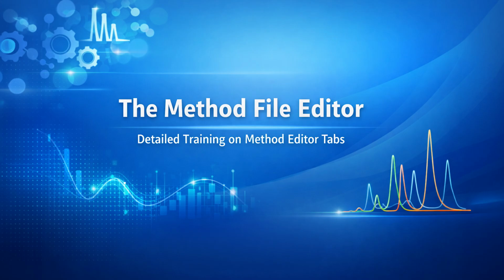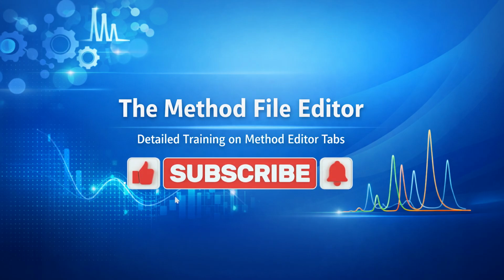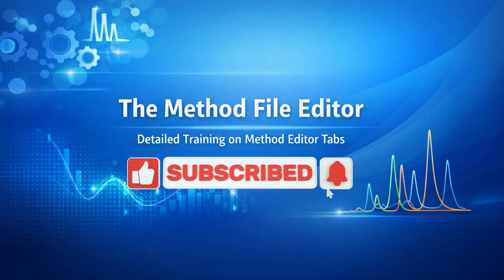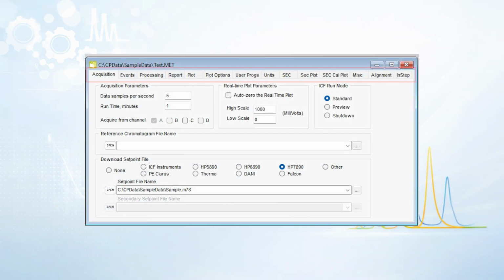In this video, we're continuing our detailed walkthrough of the Chromperfect manual, focusing on the Method File Editor, specifically the different tab sections within the editor and what each one does. This is a user training video, not a high-level overview. We'll be working directly from the manual and going through each tab and setting exactly as it's implemented in the software. Most of this video uses static screen captures from the Chromperfect interface, so you can follow along clearly.